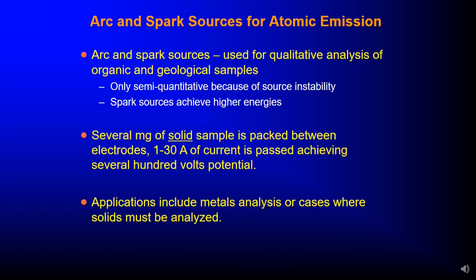Arc and spark sources are majorly used for qualitative analysis of organic and geological samples, only semi-quantitative because of source instability. Spark sources achieve higher energies.